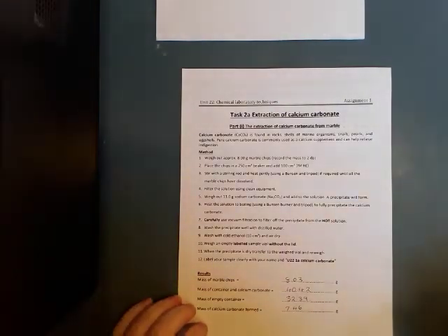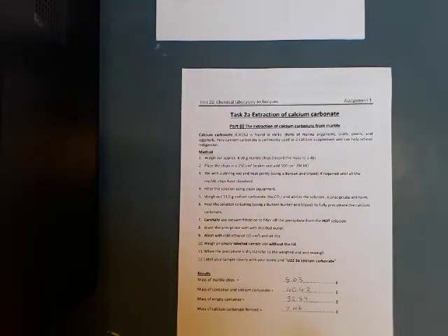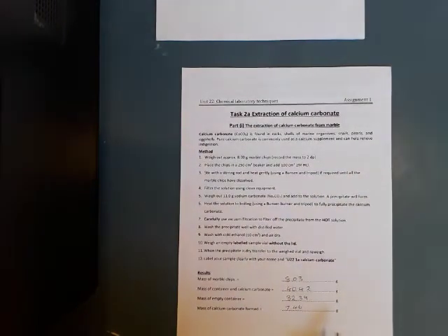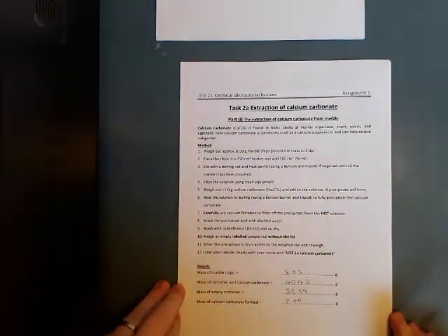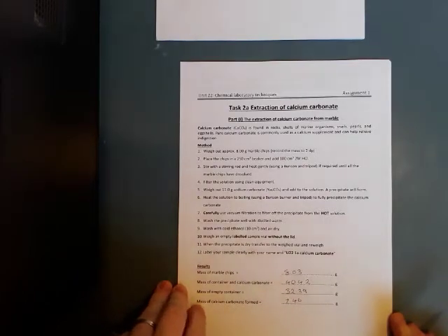Hello again. So our next installment is the extraction of calcium carbonate. And I thought this time, there's quite a bit of calculations involved with this, but I thought we'd go through firstly the method and, with that, why we're doing certain parts of the method, any issues that we could have with that method, and also any improvements that we could do.